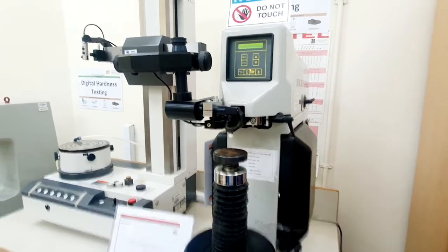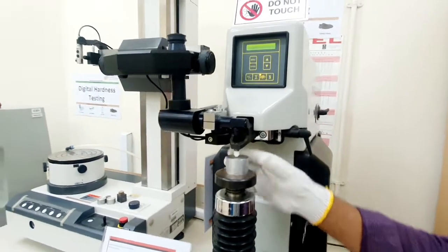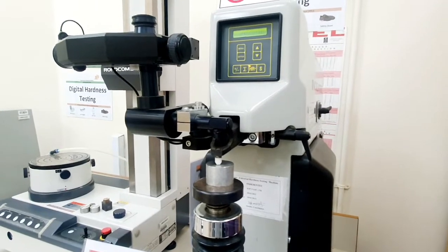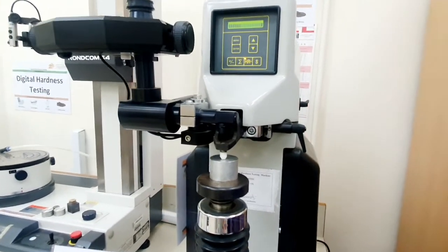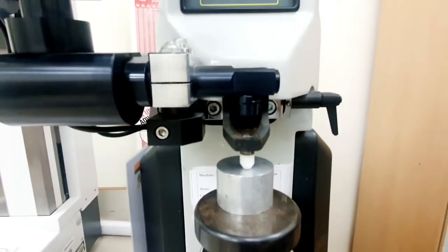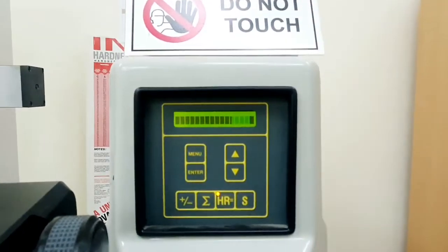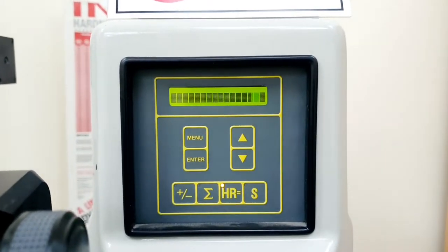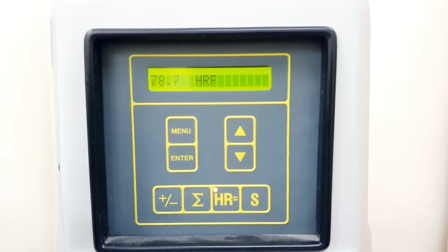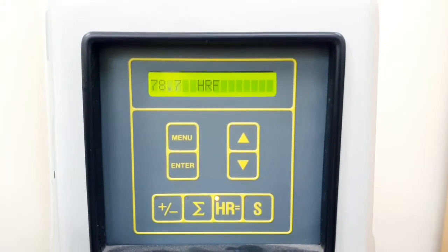Now we repeat the test for the aluminum sample. We keep the machine on the same scale — the 1/16 inch indenter with 60 kilograms load, which is the HRF scale. We adjust the table so the sample touches the indenter, and the machine starts the test automatically to give us the hardness rating of the aluminum sample. The hardness of the aluminum sample is measured to be 78.7 HRF.